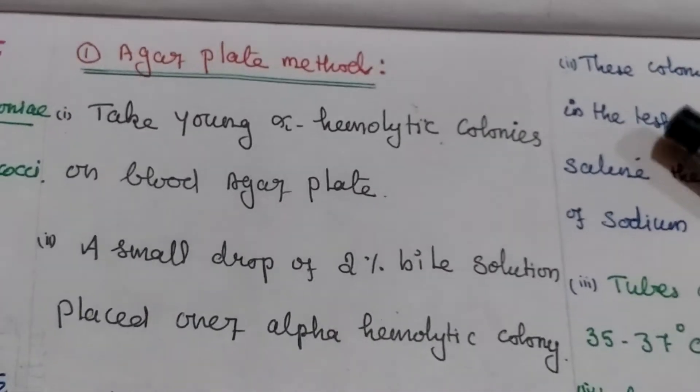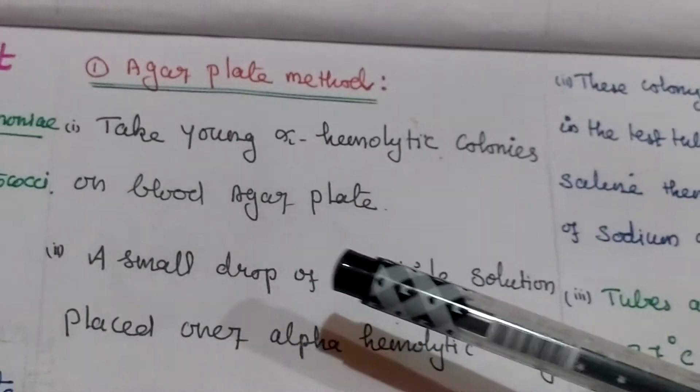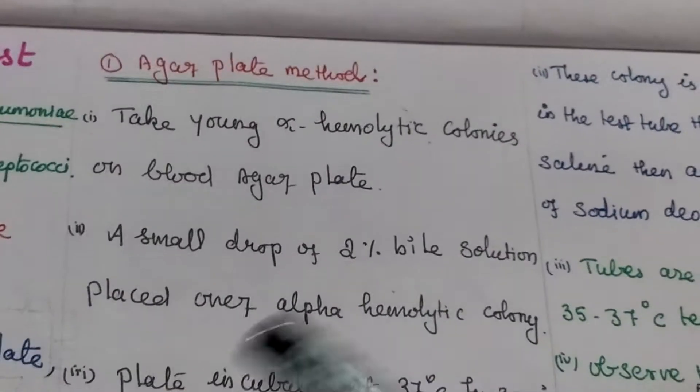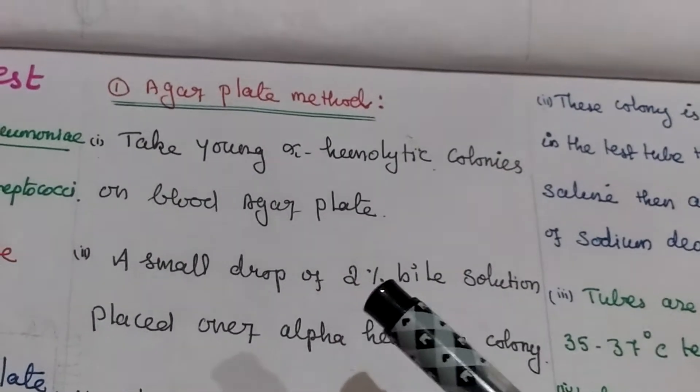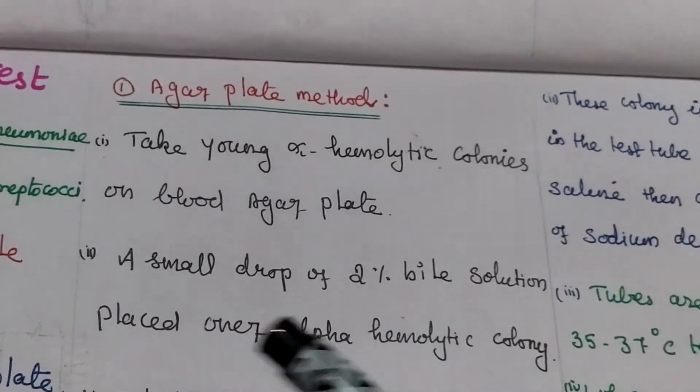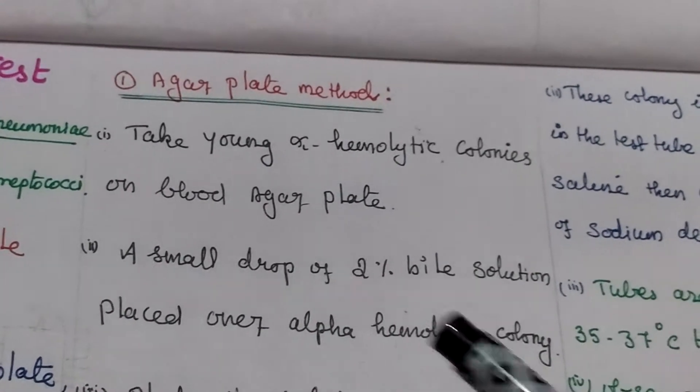Here we will take young alpha hemolytic colonies on blood agar plate. Then a small drop of 2% bile solution is placed over alpha hemolytic colonies.